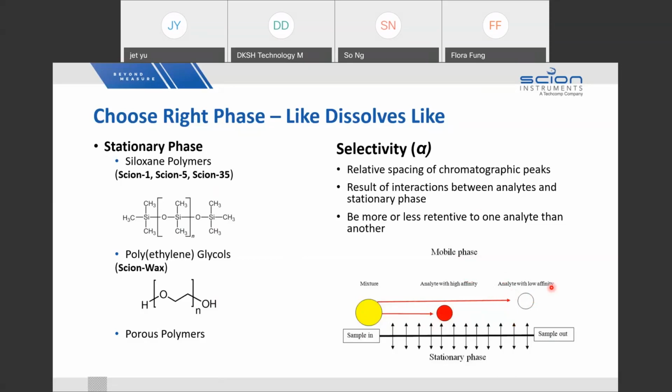So we are not talking about absolute polar or non-polar, we are talking about relative. This is the nature of the separation. The difference in terms of polarity is very weak. Sometimes from the molecule we are not able to tell, but from these separation technologies we are able to differentiate.